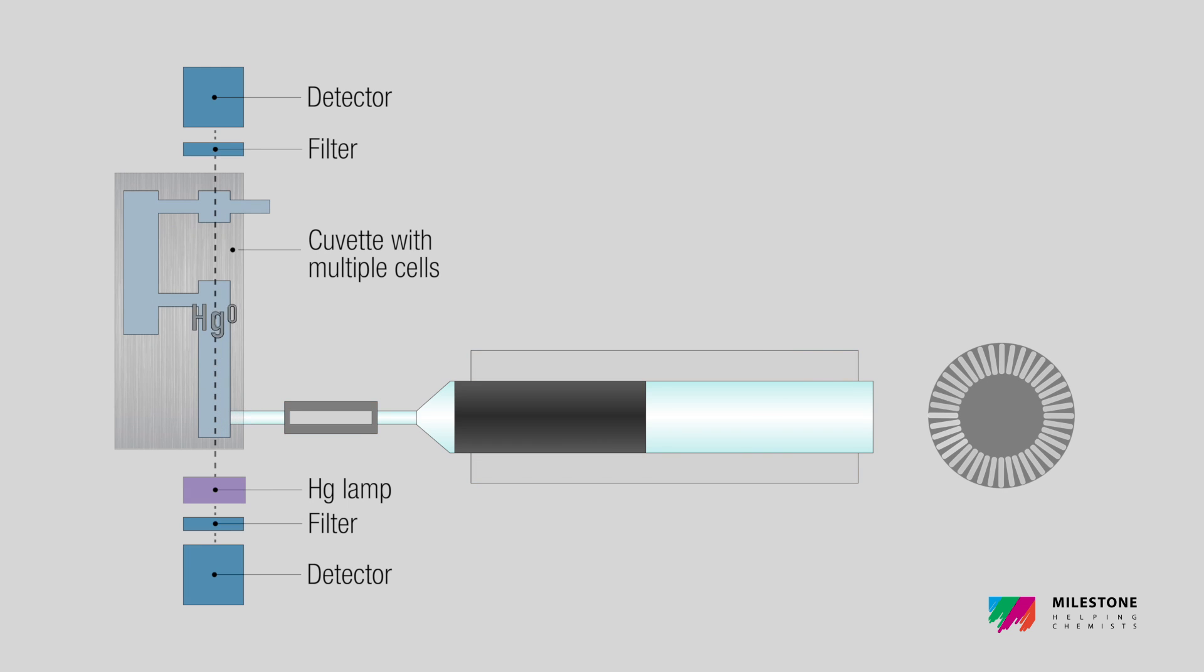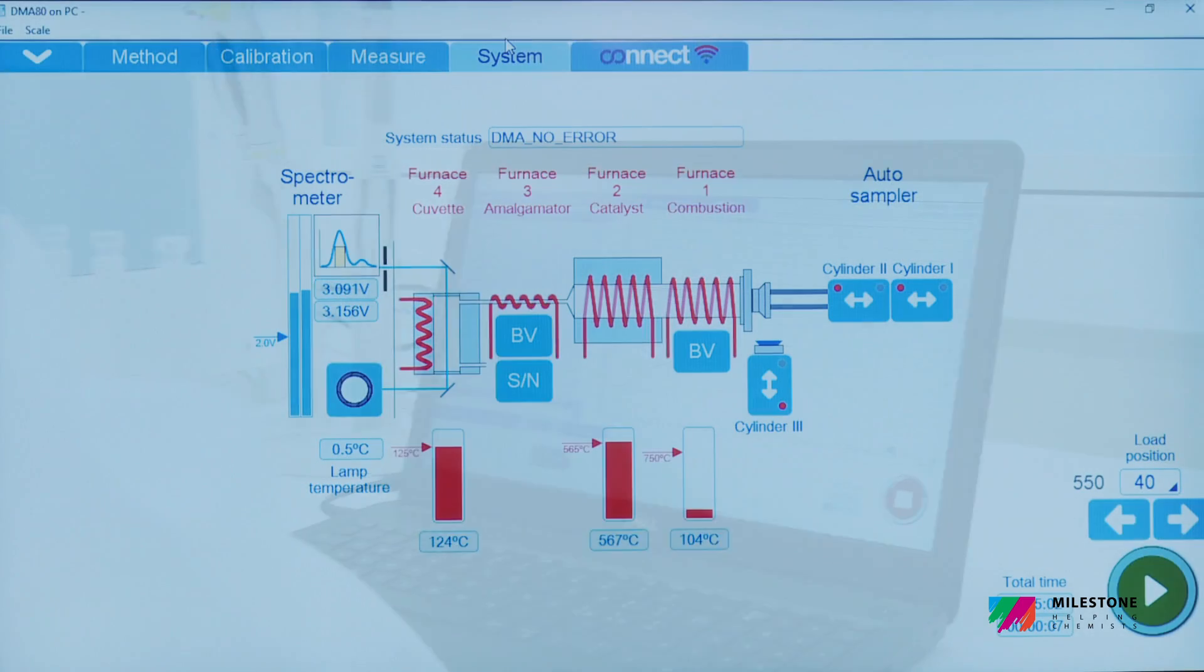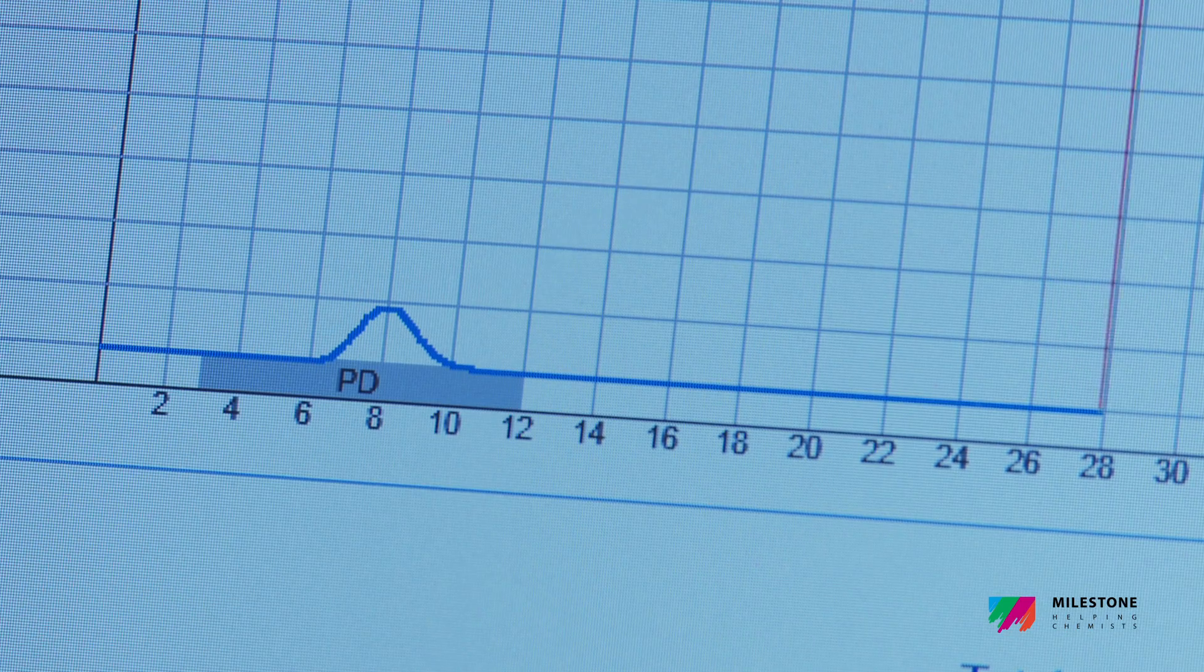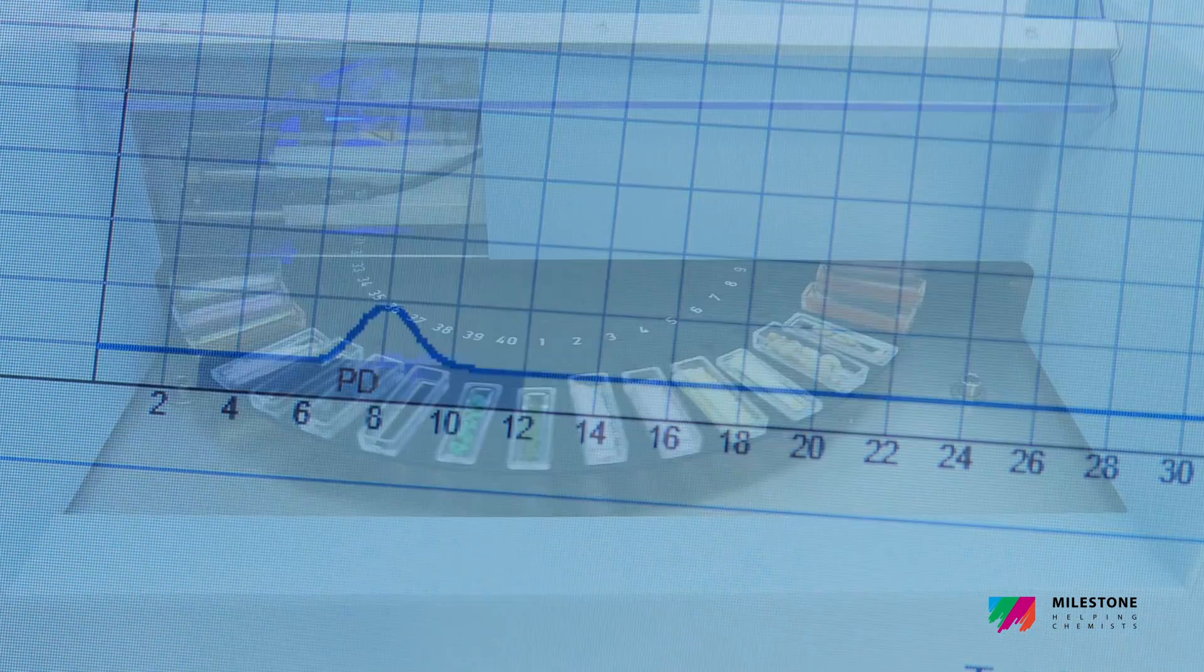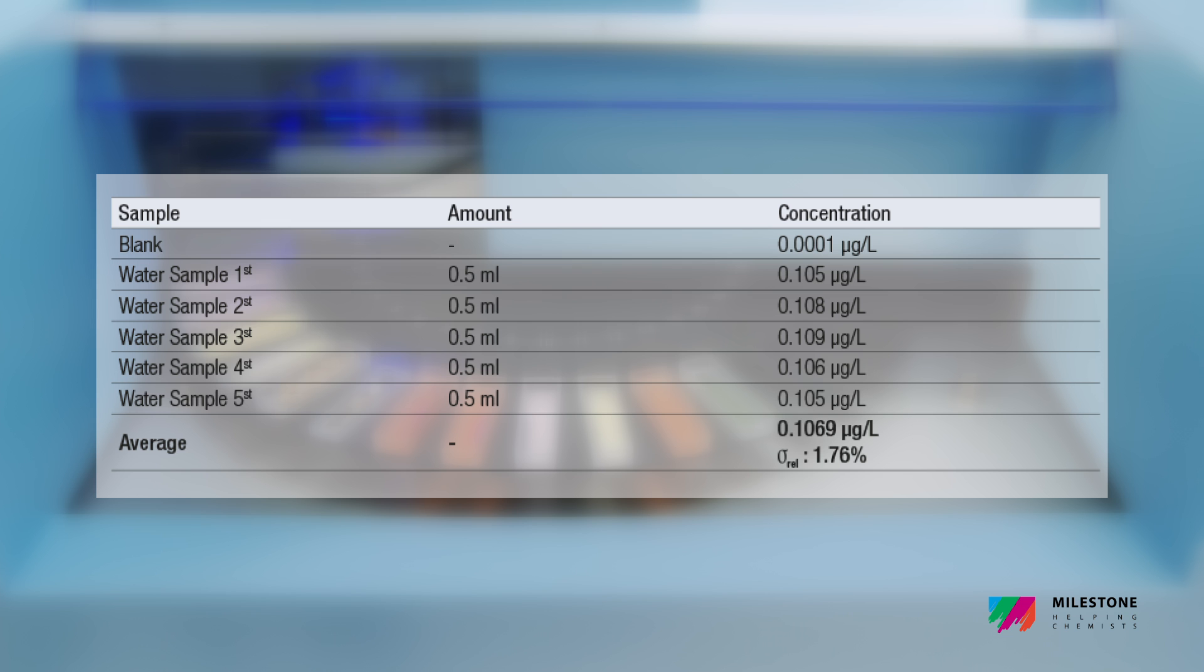Mercury is then released into multiple measuring cells positioned along the optical path of the spectrophotometer. The double beam technology dramatically reduces the signal-to-noise ratio, improving the quantification limit, accuracy, and precision, ensuring superior reproducibility, reliability of the results, and greater performances, even at PPT levels.